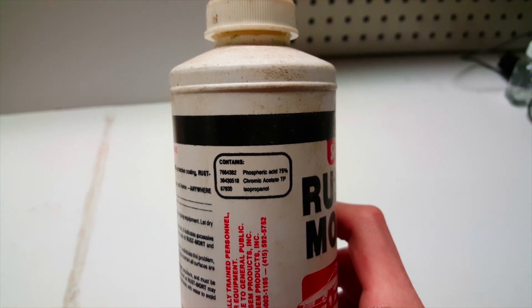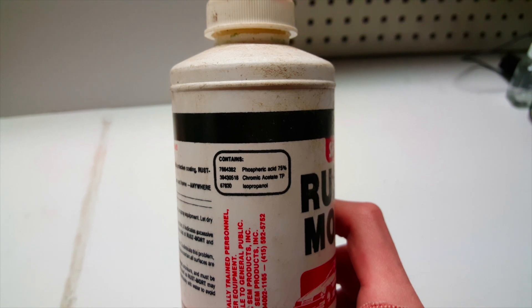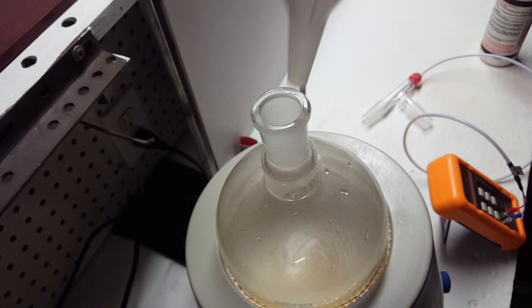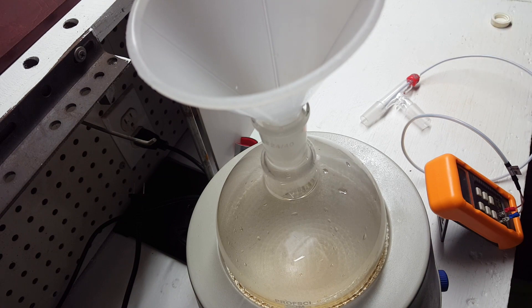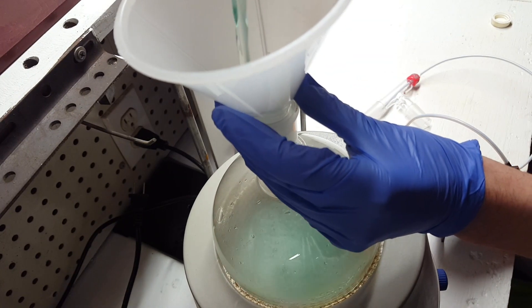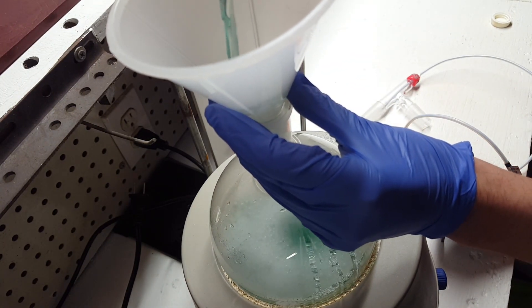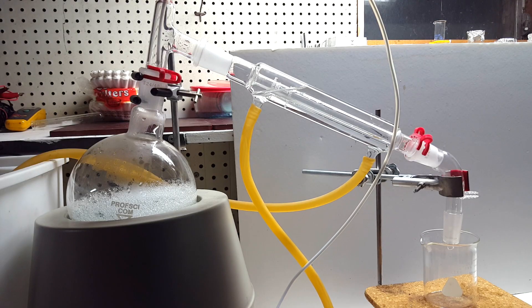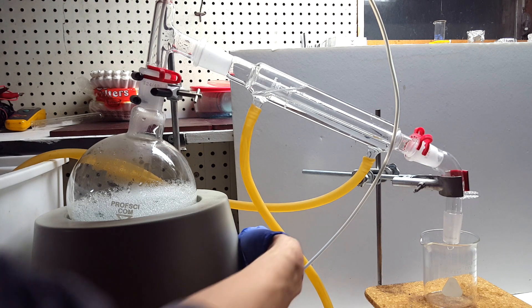It also apparently contains some isopropanol and chromic acetate, which I'll need to separate out. To separate out the phosphoric acid, I decided I would go ahead and do it through distillation. So I set up a 1 liter round bottom and poured in the rust remover, then set up the simple distillation apparatus and turned on the heating and stirring to get things started.